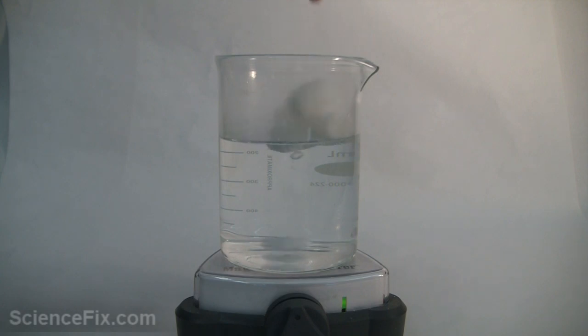We are putting some of the starch pellets into a beaker of warm water. We have a magnetic stir bar at the bottom. We want to dissolve the starch material into the water.